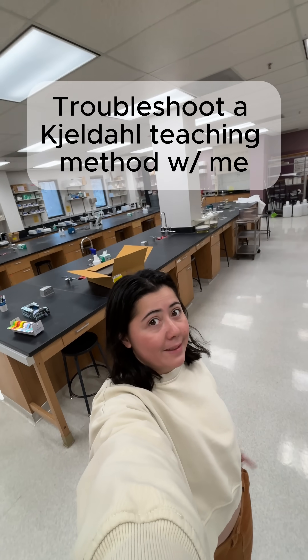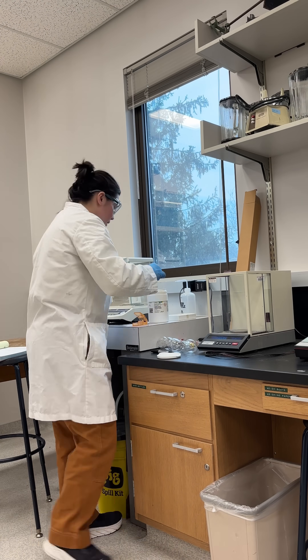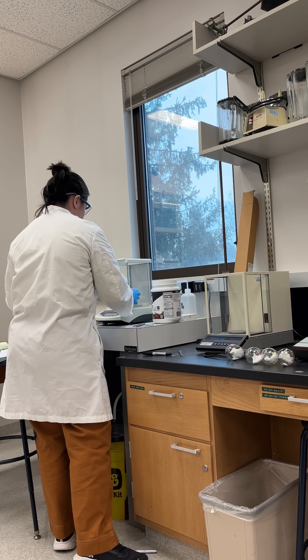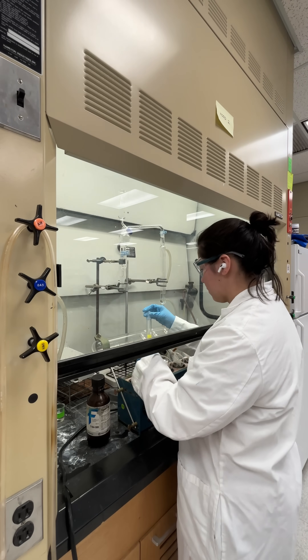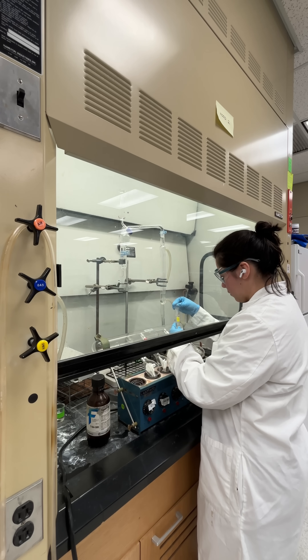Come with me to troubleshoot a Kjeldahl teaching method. I showed up at the lab and immediately got started weighing things because I had to get this method done. I weighed out five different samples of a chocolate protein powder and I am here adding Tween to help prevent foaming — which, spoiler alert, did not help prevent foaming.